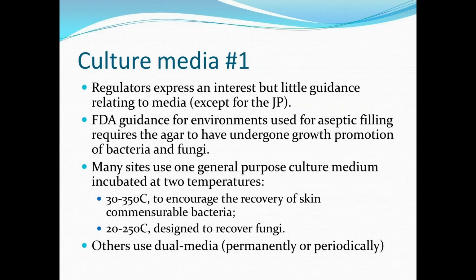Now, along with most aspects of environmental monitoring, regulators express an interest but give very little guidance. Likewise, regulators express an interest in fungi and environmental monitoring, but there's no document produced by any regulatory agency that says anything about the types of culture media required, with one exception, which is in the Japanese pharmacopoeia.